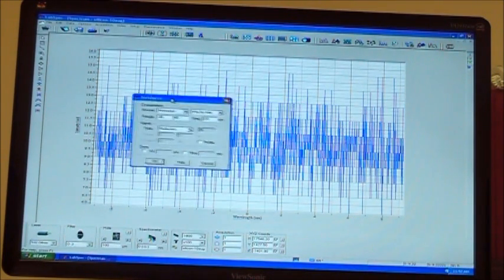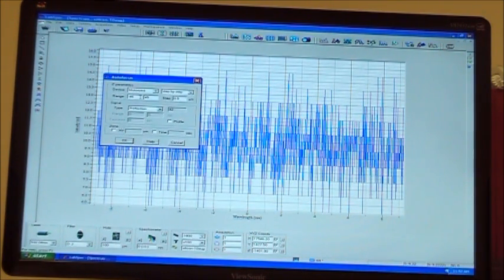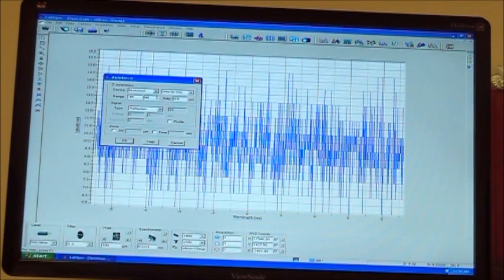Autofocus again, this here is for your autofocus device. You can set the range you want it to move, minus 45 to plus 45. The full range of this, I believe, is 100 is the max it can go. But to save time in your autofocusing when you're doing this on a stage, if you know that you have a sample that's relatively flat and there's not much deviation in it, you can change the range to, like, minus 10 to plus 10. Because in that way in your map, it'll cut your map time down some, because it won't be checking quite as large as a range. It'll be checking a smaller range, which will make the autofocus operate faster.